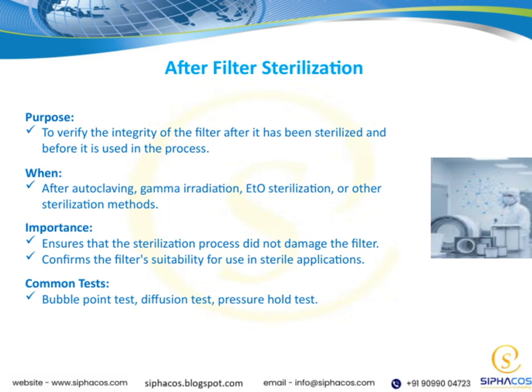Common tests used for this purpose include the bubble point test, diffusion test, and pressure hold test. These tests help us identify any potential compromises in the filter's integrity, giving us confidence that it will perform properly during actual use. Ultimately, conducting these post-sterilization tests helps us ensure that our sterilization process is effective without damaging the filter, maintaining the overall integrity of our sterile processes.